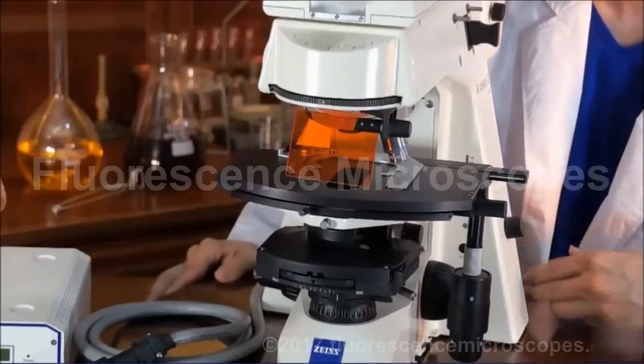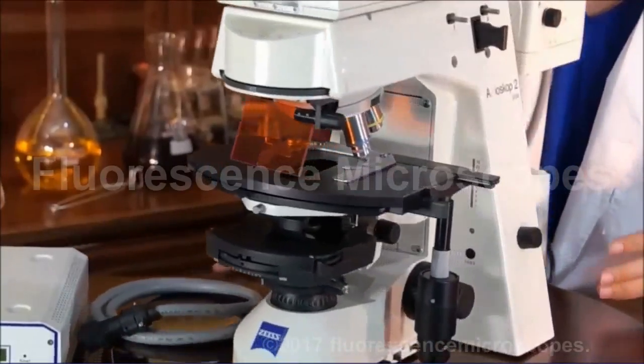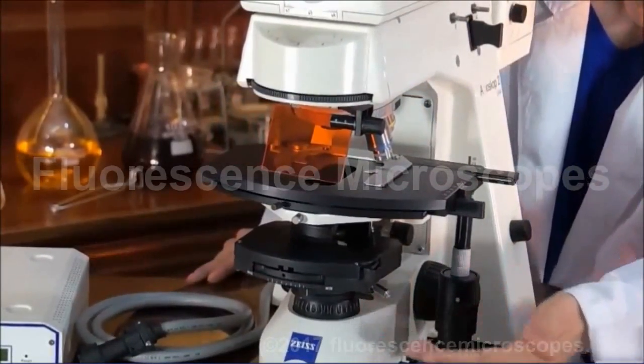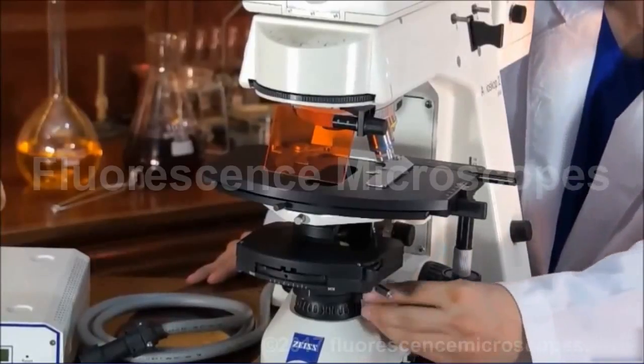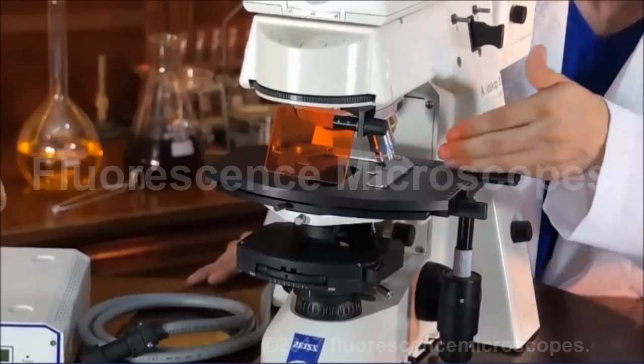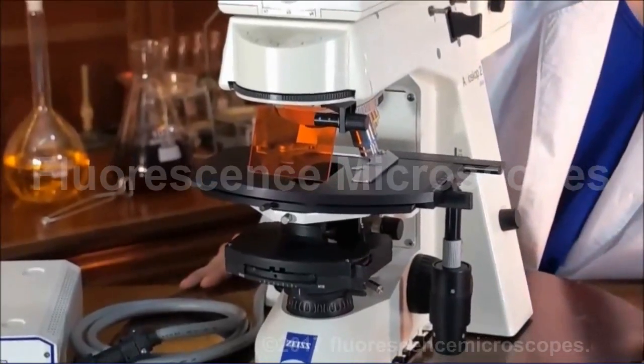So we've talked quite a bit about the transmitted light with the halogen in the back, transmitting through several neutral density filters, going through field iris diaphragm, going through some flip out filters, condenser into your specimen, on through into your optics and eyepieces.